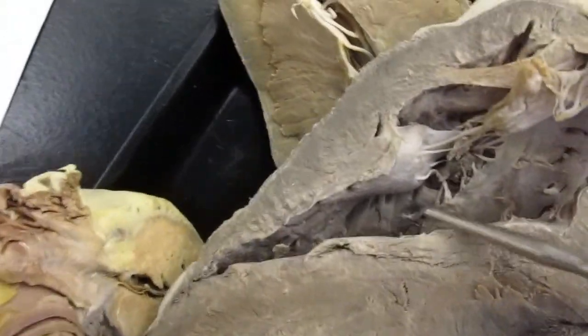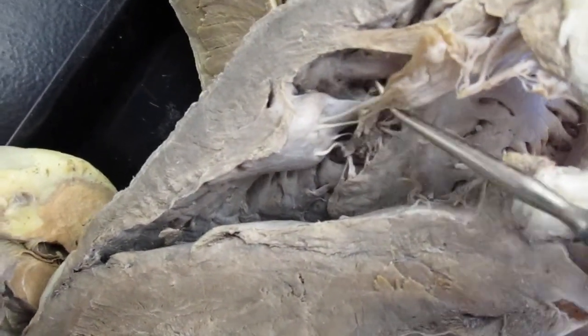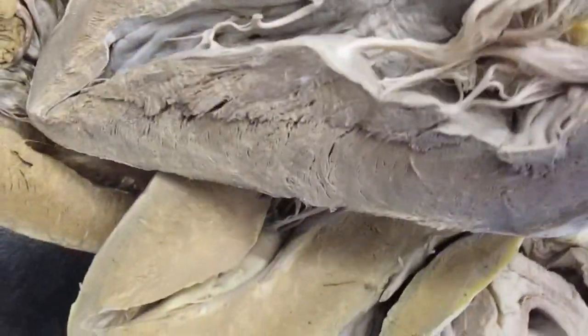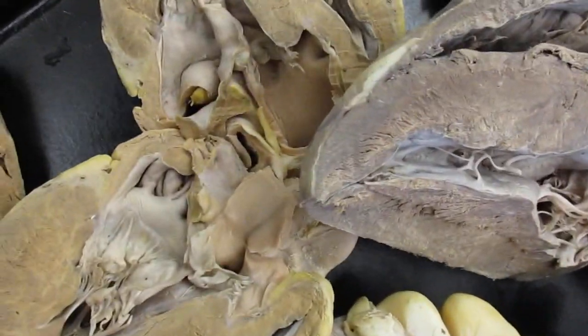And then you can see the trabeculae carneae here, and then the chordae tendineae. Okay. And let's see if there's anything else here. Right here, that shows you the aortic valve. And let's see if there's anything else.